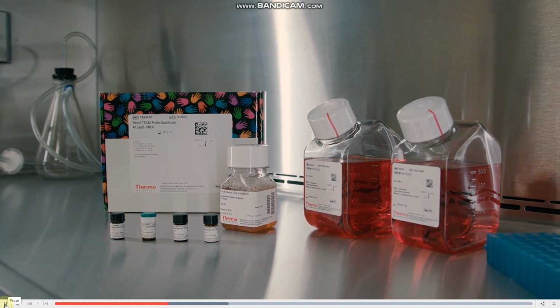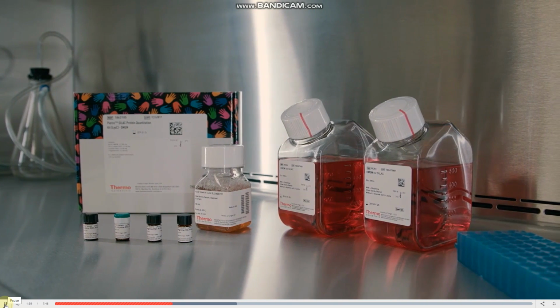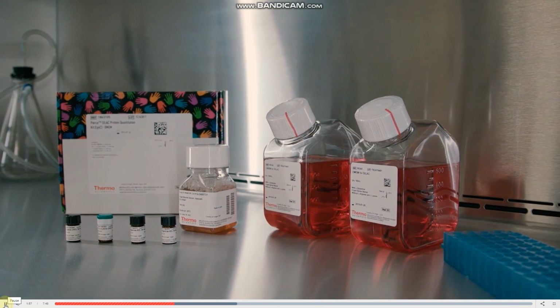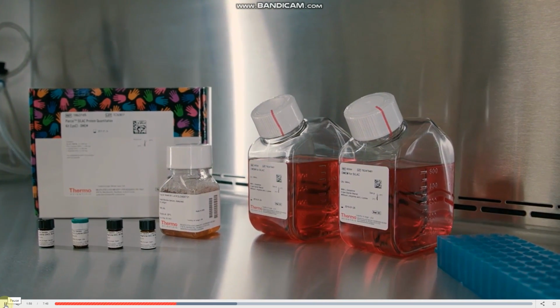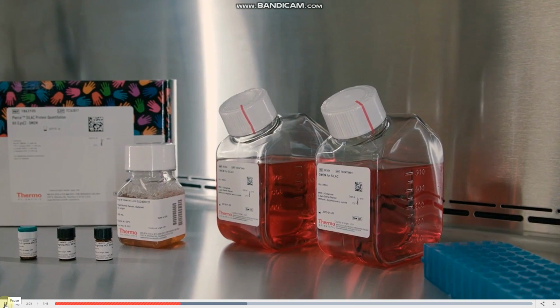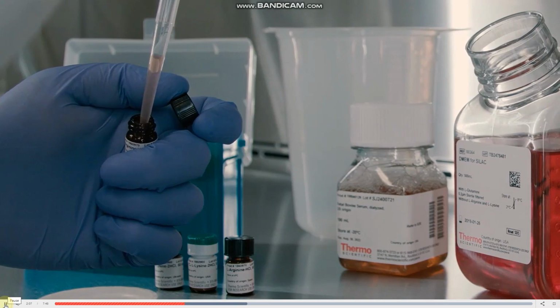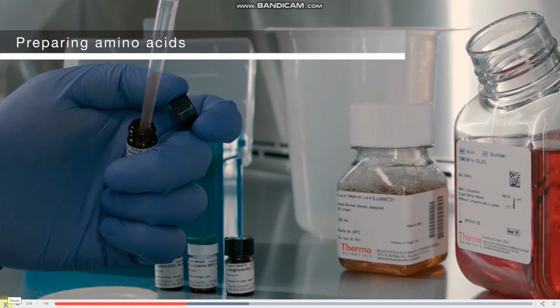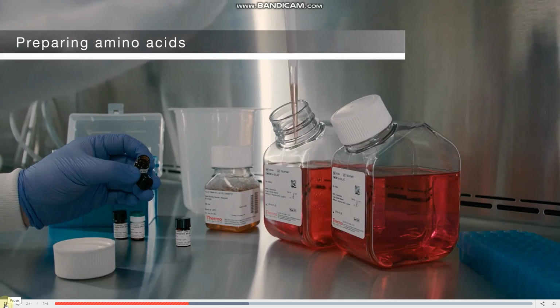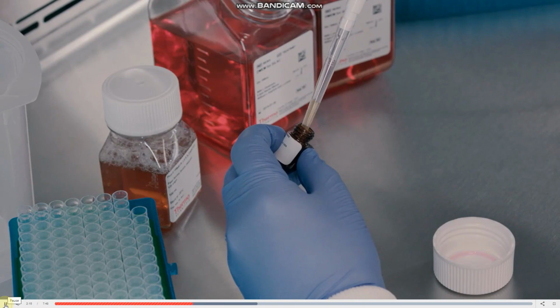Here we describe the steps to metabolically incorporate heavy amino acids into cells prior to protein digestion. All reagent preparation and cell culture must be done in a tissue culture hood under sterile conditions to prevent contamination of your cultured cells. The first step is to prepare the amino acids by dissolving 50 milligrams of each heavy or light amino acid in 1 milliliter of medium and mixing thoroughly.